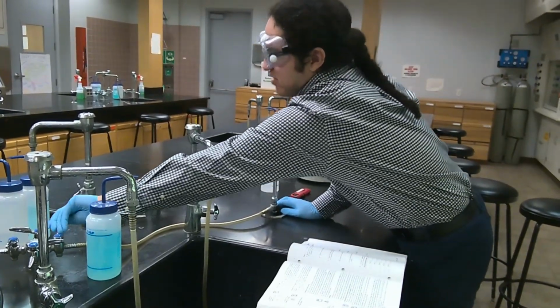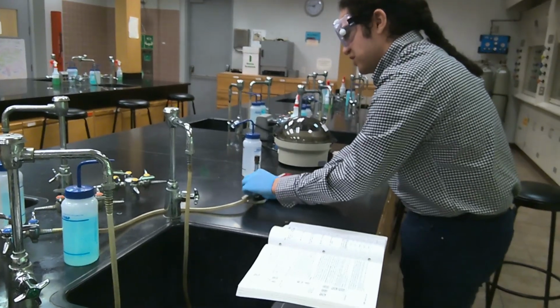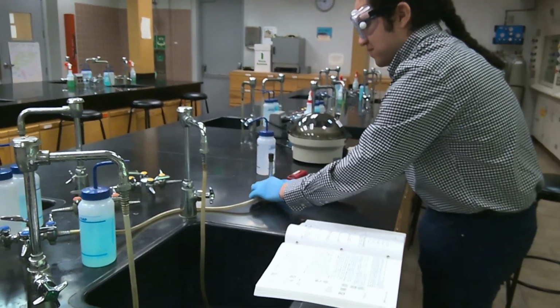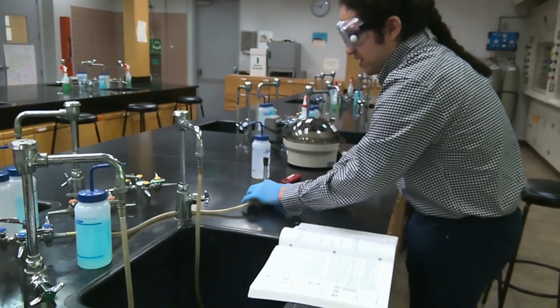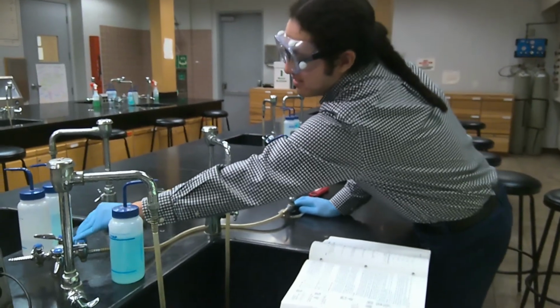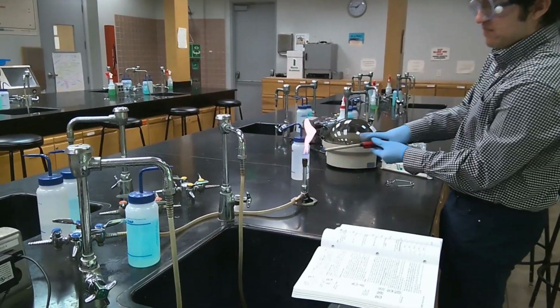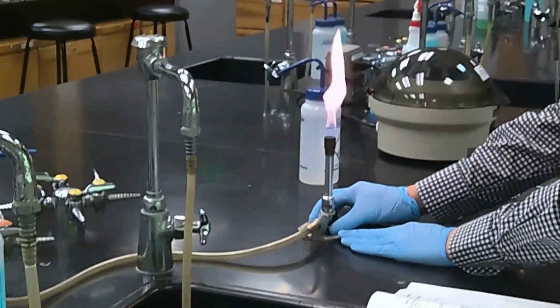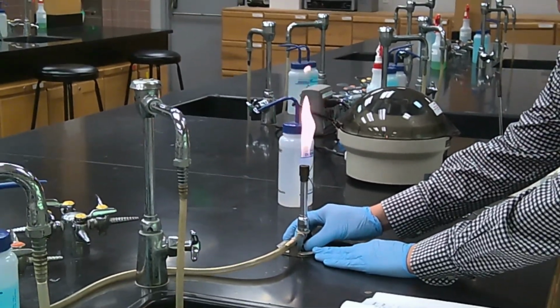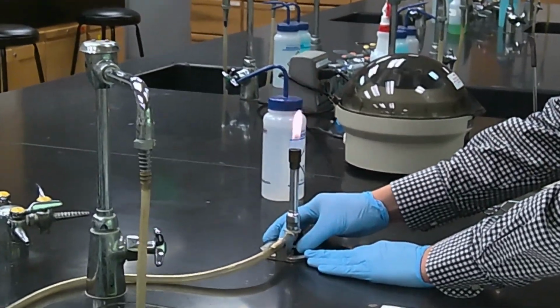Let me get the Bunsen burner set up first. So I'm going to have everything closed initially. And then I'm going to open both the gas and the oxygen intake slightly, turn on the gas, and light my flame from the side. So I'm going to reduce the gas.